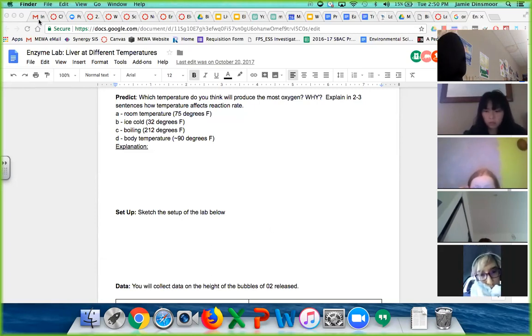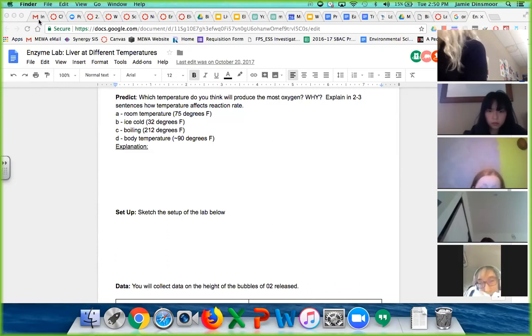I really need a glove to do this. I'm going to change my strategy. So in case you guys don't know what I'm doing because I'm off camera right now, I'm about to burn myself. Not on purpose, obviously, but I have a very hot item and I don't have a glove, which I believe we used to have, and I don't know where it is. So I'm trying to figure out how best to do this without burning myself and failing.